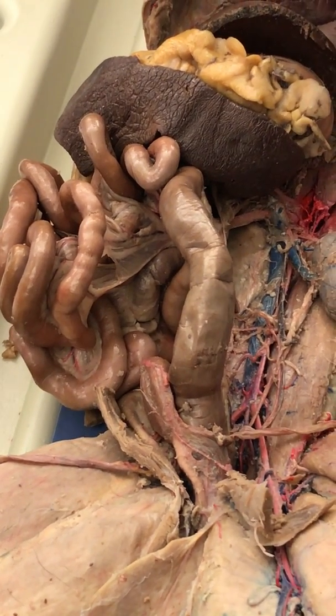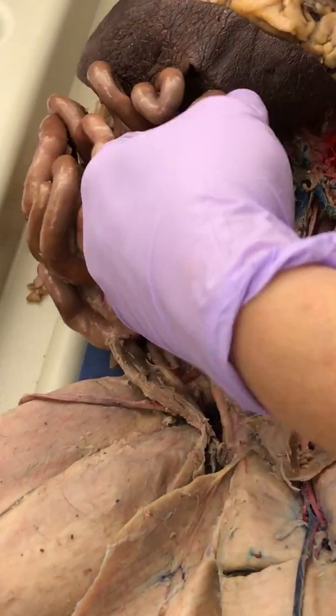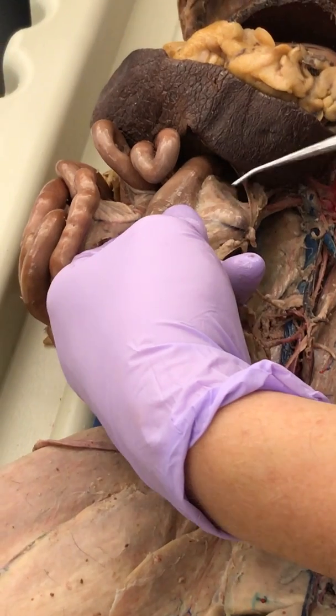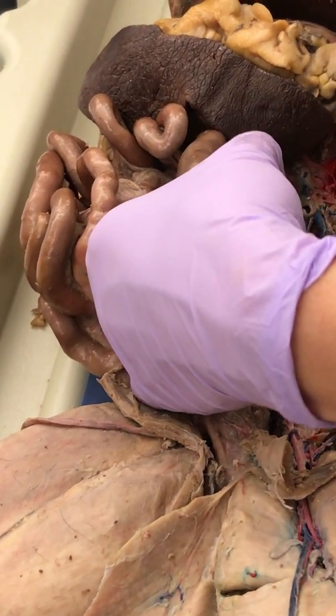Yeah, but didn't you guys do this dissection, the male dissection? Yeah, you came in early? Yeah. Quick question. What is this tissue right here? Mesocolon. That's good. Oh, you still have lymph nodes in it too. Super cool.